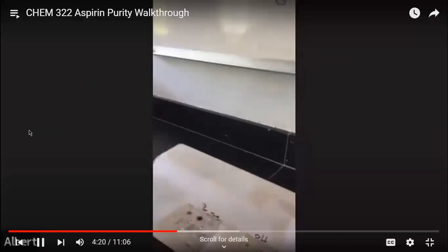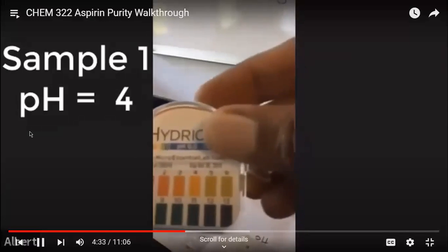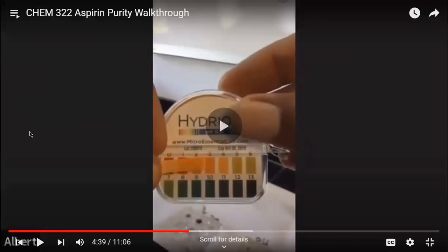Orange? It didn't change much, did it? So where are we? It's orange, kind of right there, about 4. Let me show them so they'll know. So this is the pH guide, and this is the strip after she dipped it. So it looks like it's close to about a 4.